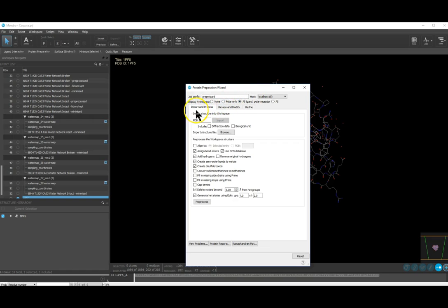And then the first thing we're going to do is on this import and process tab, we are going to switch to a faster processor here, just because I can. Have another computer sitting over there. We're not going to align this because it's the first structure we brought in from DJ1. It's going to be alone. There's no reason to align it to another structure in here. As we bring in further structures, we can align them to this structure. It makes them easier to look at because they look similar. I would say use the defaults. Don't worry about it. Although I like to do this. If there's anything missing, we can fill them in with some advanced molecular modeling tools.